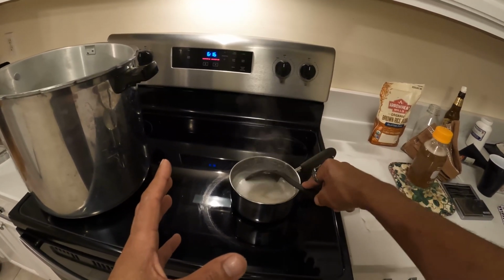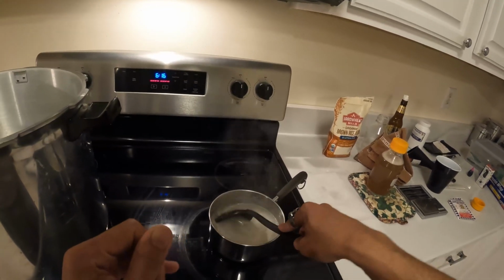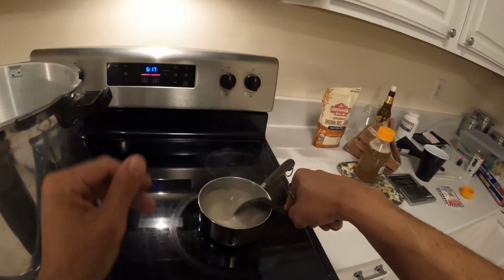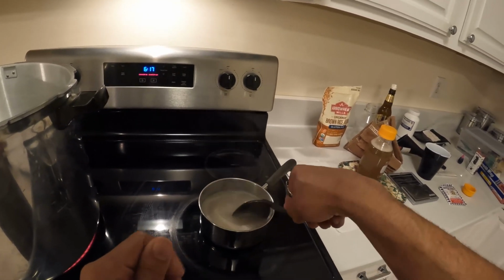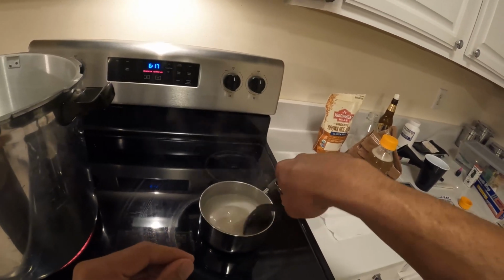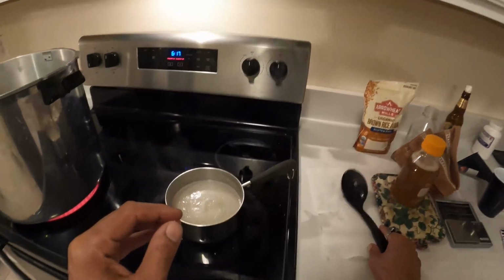Some species respond better to food that they're already accustomed to eating. You can train them. You can show them how to eat new food. You can split the plate up half and half, so to say, and direct them to a new food source. But just starting out, let's just keep it simple.